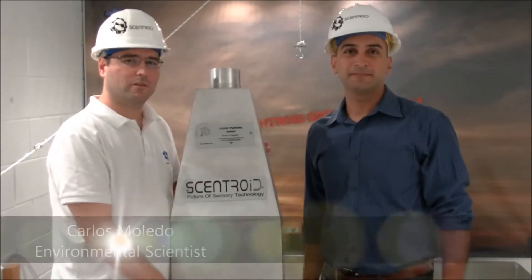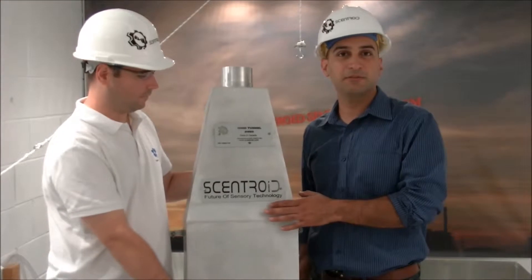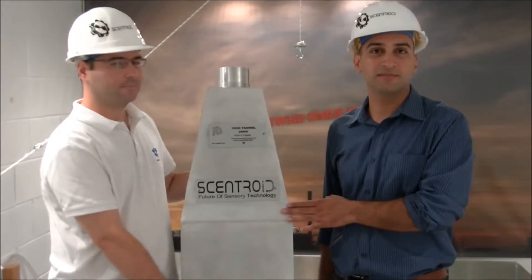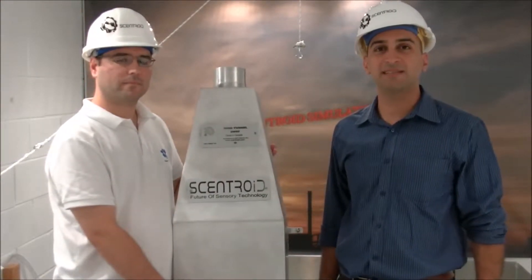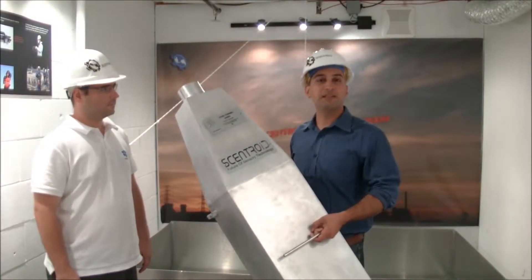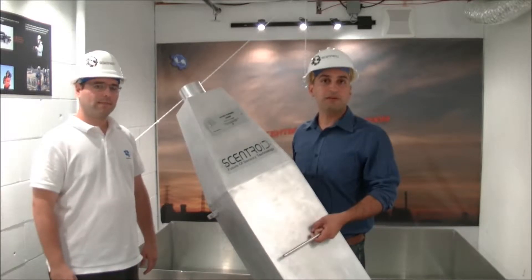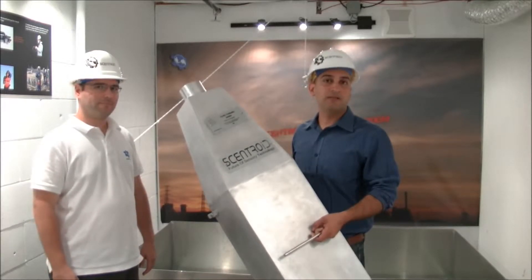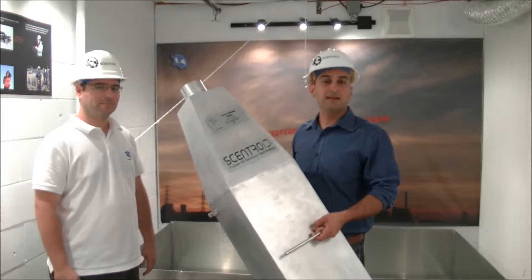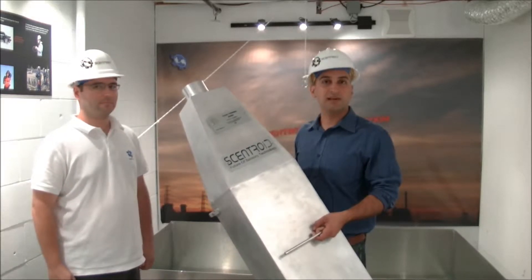Hi, this is Adam Bakteri from Scentroid, and this is Carlos Melito. We're here today to introduce a new sampling device: the Scentroid SW60 wind tunnel, also known as the ventilated sampling hood. The wind tunnel is used to take a sample from a liquid or a solid passive source, such as a compost pile or a holding tank. We're going to take some time today to show you how this device works and how you should use it.